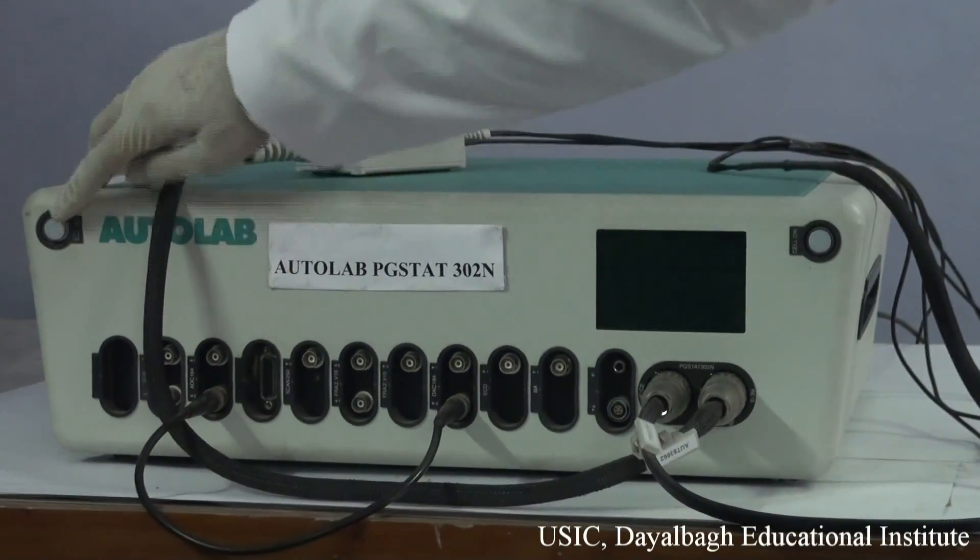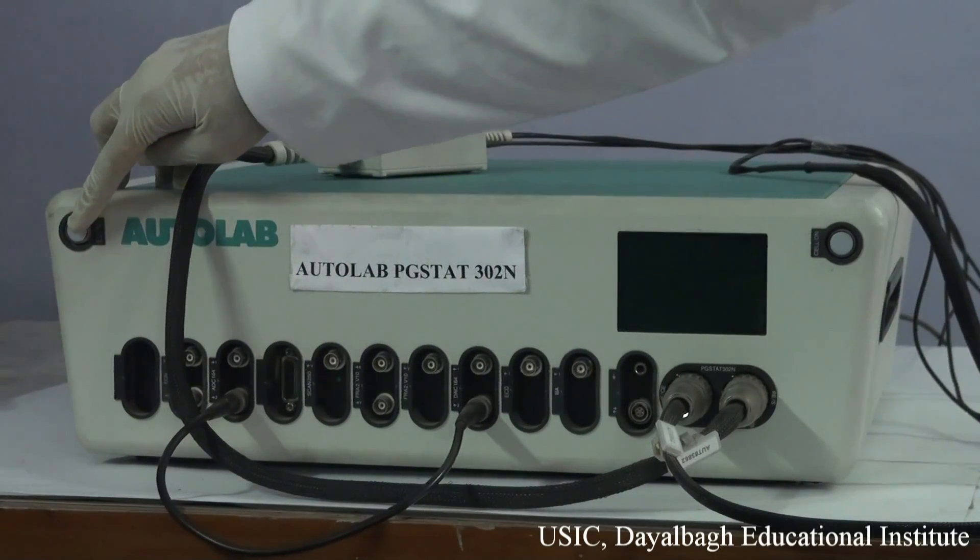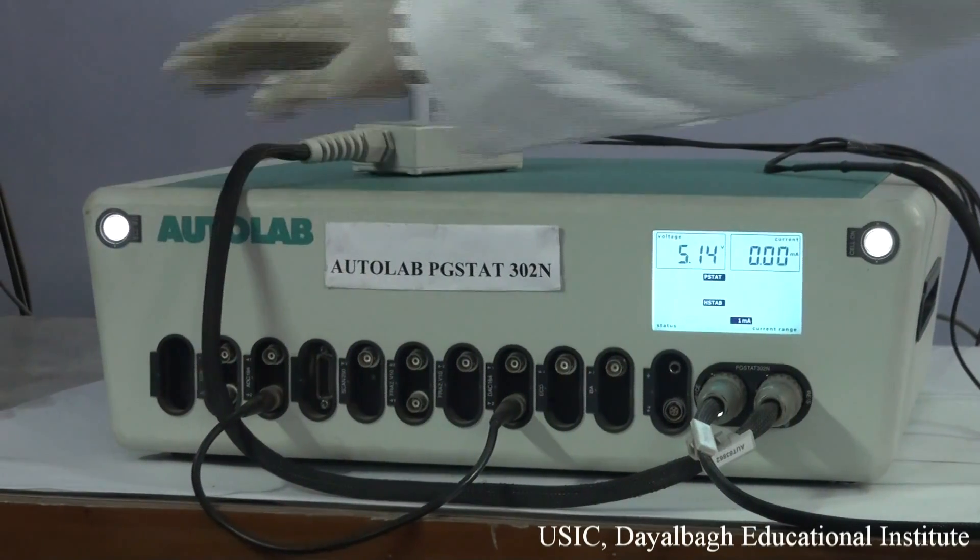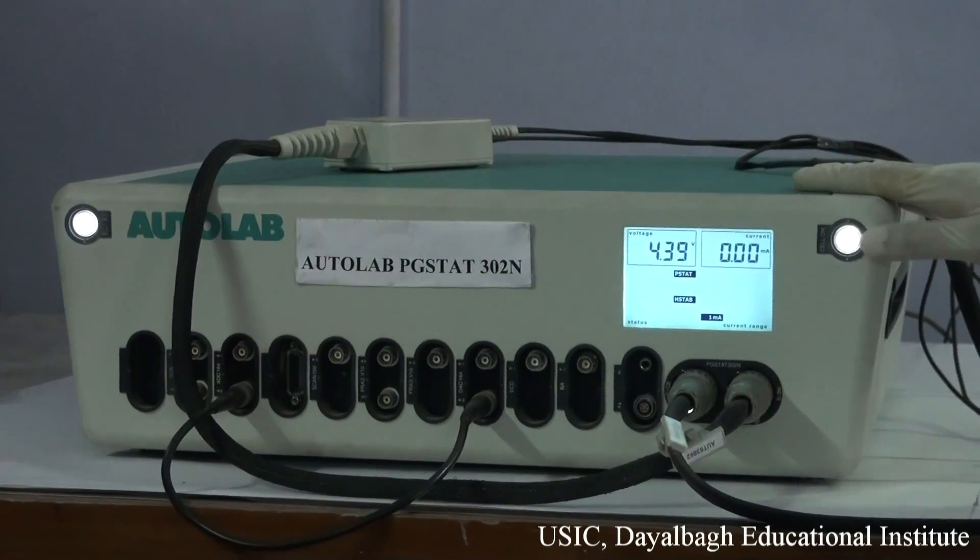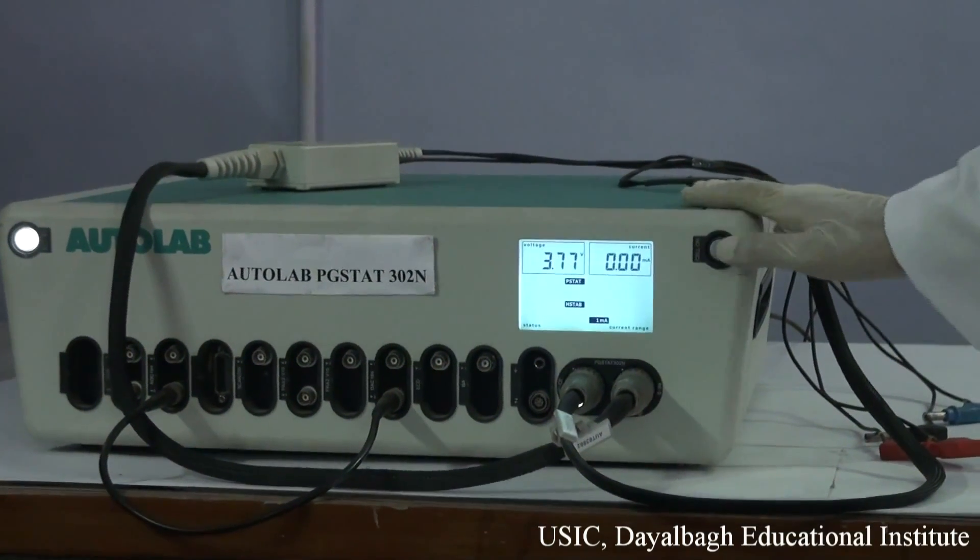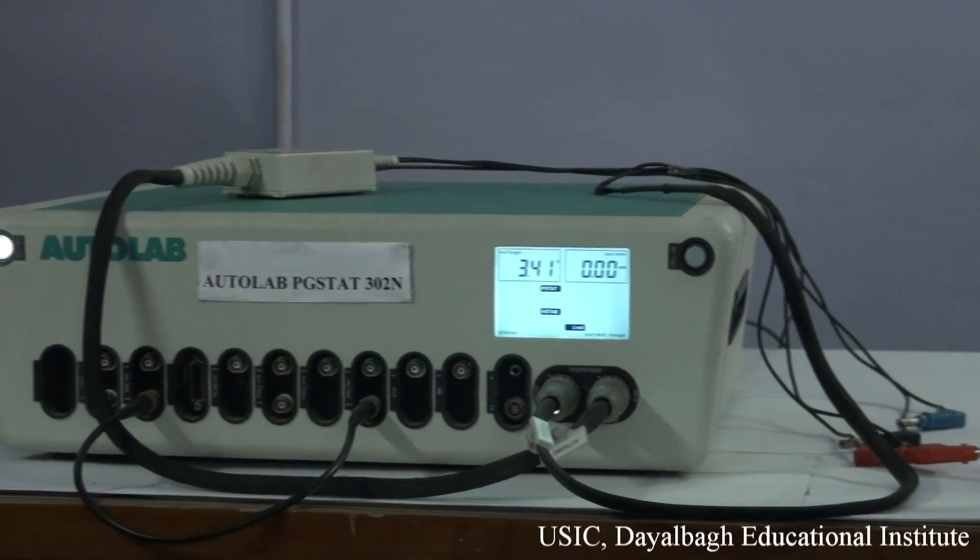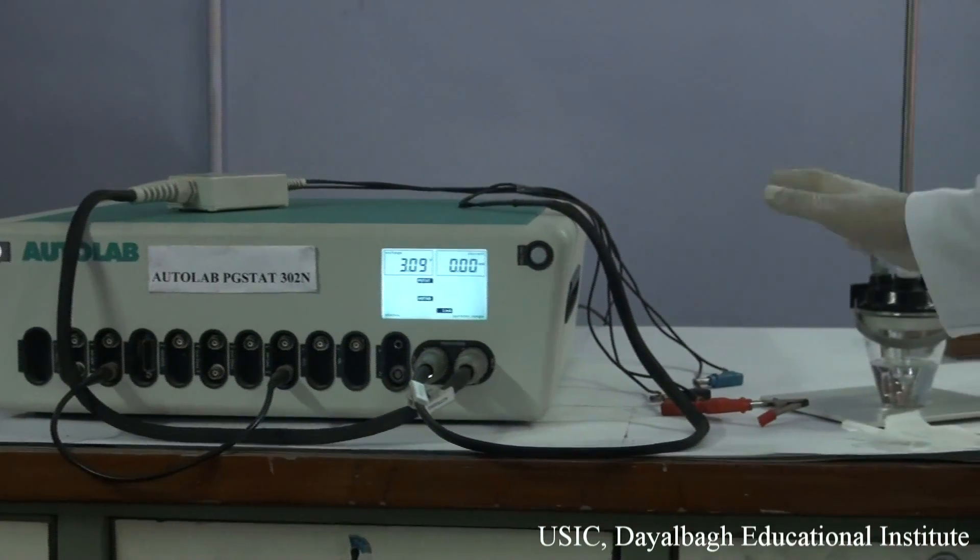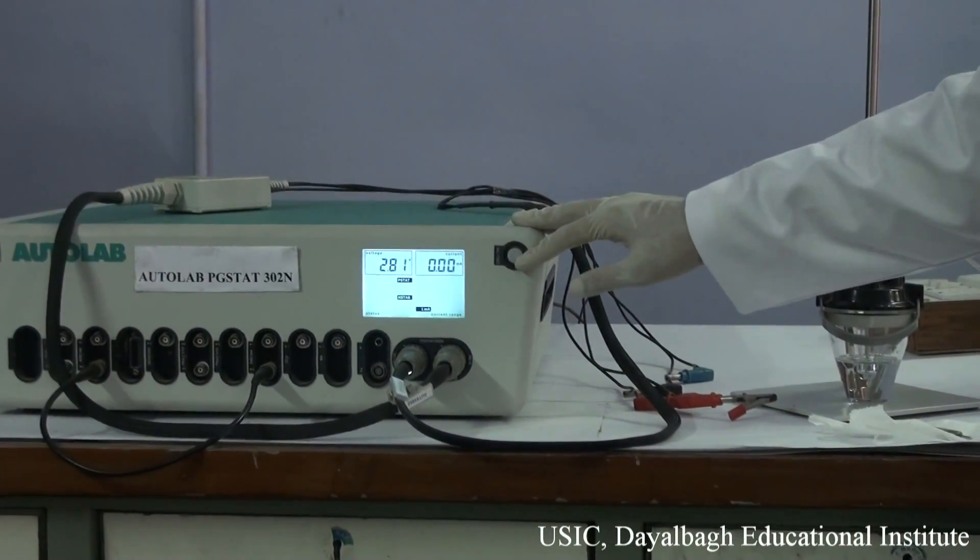First of all, we switch on the main button of the instrument. Switch off this one as it connects to the electrode system. When we set up the three electrode system, after that we will press this button.